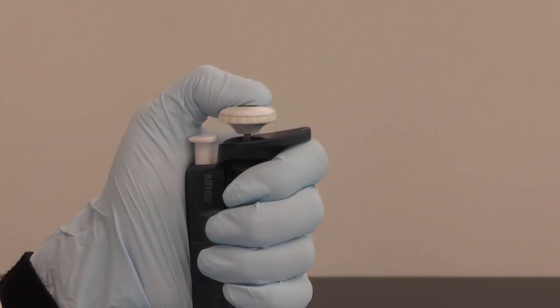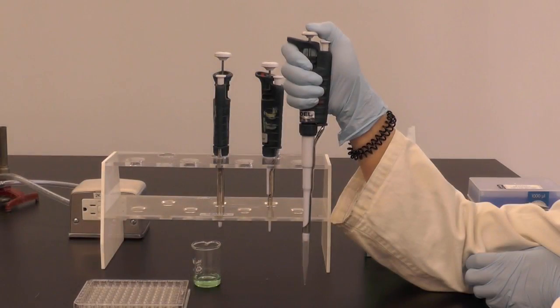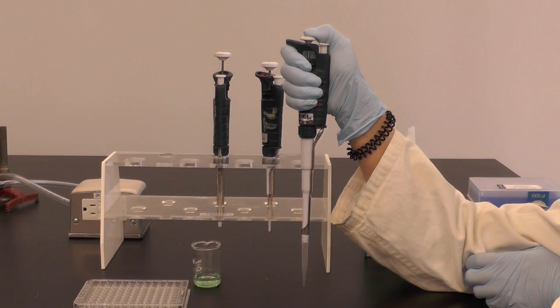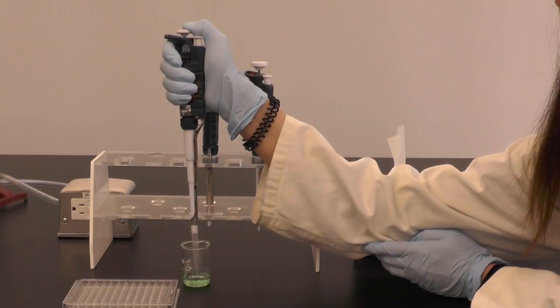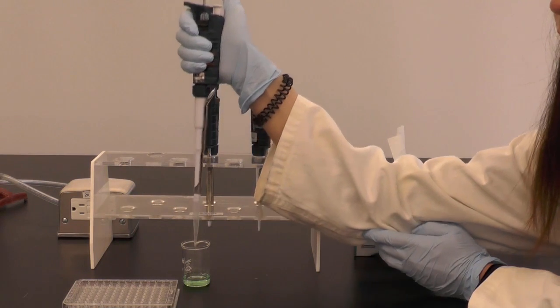As mentioned before, Pipetman pipets have two stops. To reverse pipet, push the push button to the first stop and push a bit beyond the first stop but not all the way to the second stop. Then insert the tip into the liquid and slowly release the push button to draw up the liquid.